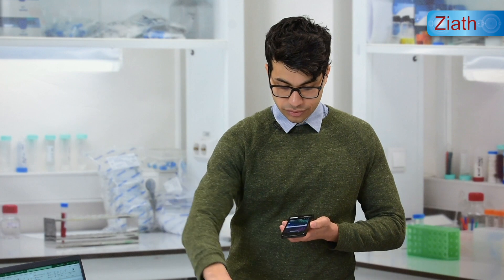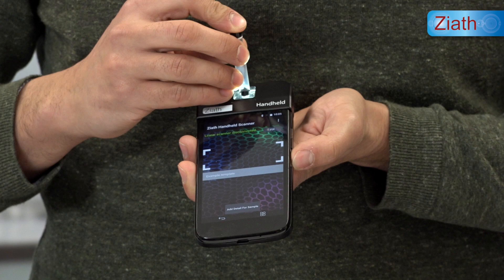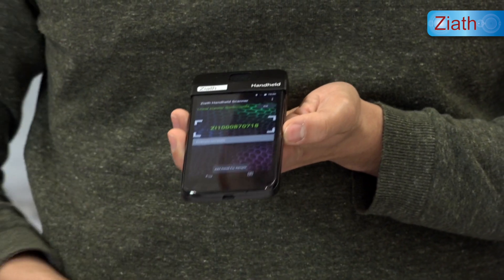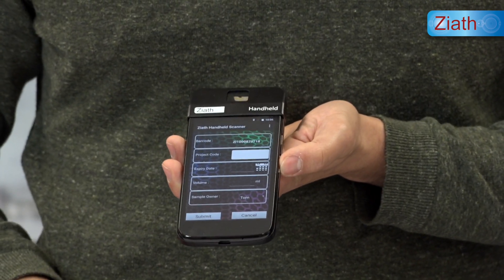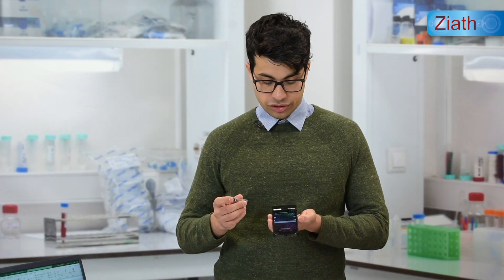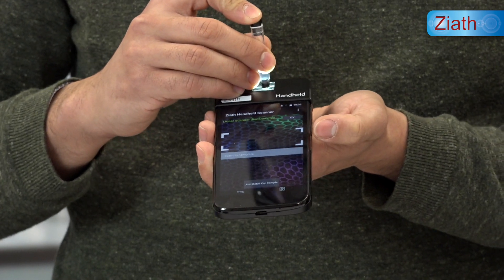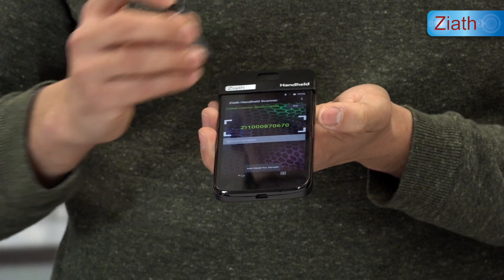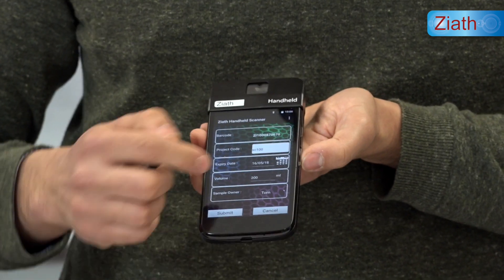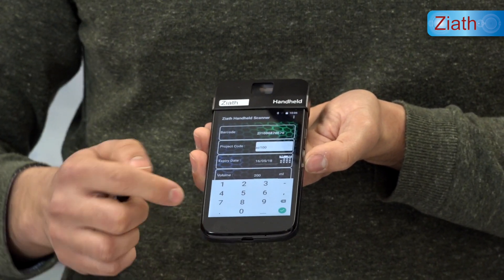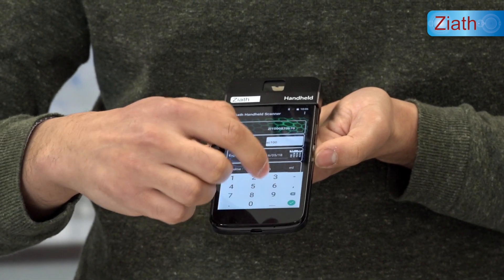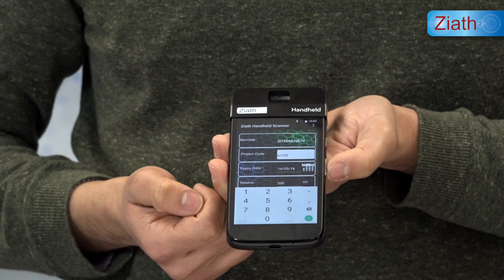If we want to edit one of the samples contained in the file, we scan that sample that we have already added sample information on and then add detail for the sample — that information can now be edited. For example, if I wanted to change the volume of an aliquot in a tube, I can scan the sample, add the detail for the sample, select the volume field, change the volume, and then click save.